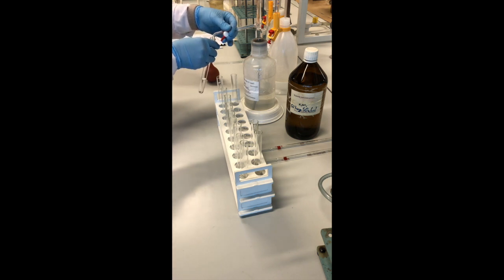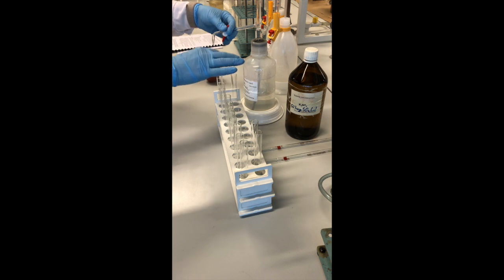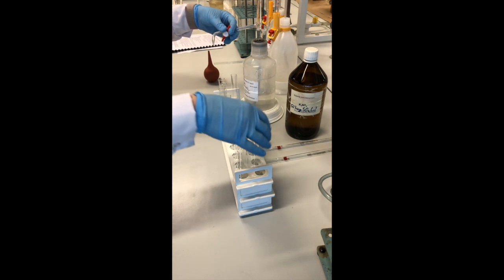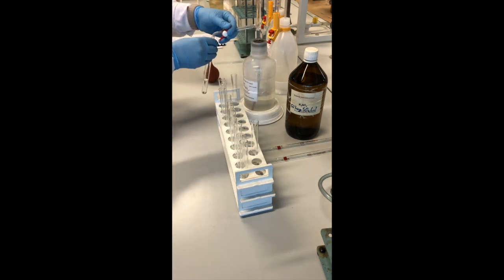If we would like to check the concentration of sulfur dioxide in ambient air, we should take a sample of air from the outside and use another method. This is the colorimetric method, but you don't have this exercise in your plan. So here are our samples.